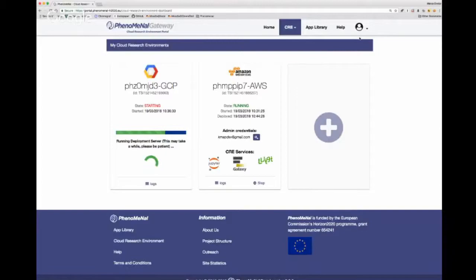with the question. So now that we have logged in, we can see a couple of new things in the portal that weren't there before as we were accessing as anonymous users. The first thing we notice is the user menu on the top right. The user menu allows us to see with which account we have logged in, and it also lets us sign out when we're done.